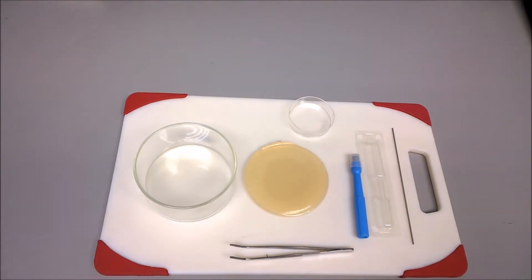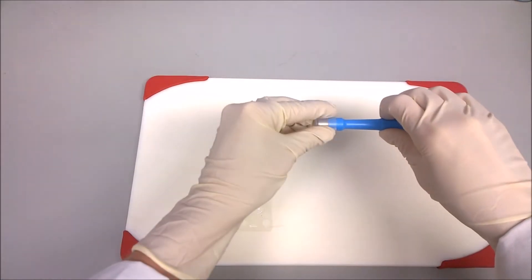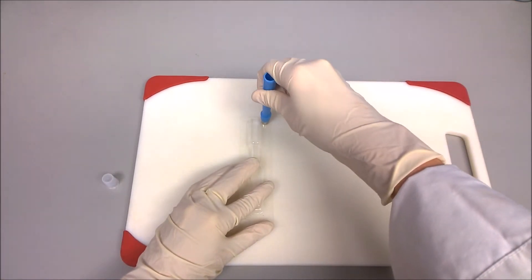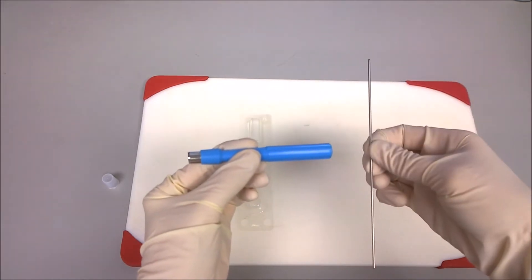Using tweezers, unmold the hydrogel and place it on the cutting board. Using an 8 millimeter biopsy punch, first punch the plastic to create a disc that will protect the hydrogel during sample extraction when using the metal rod.